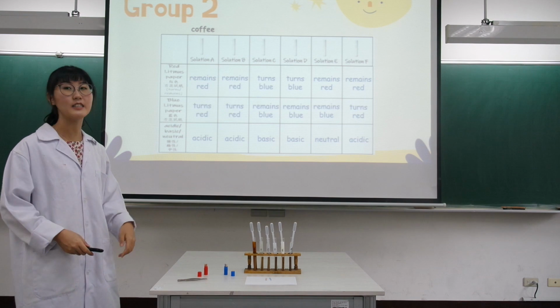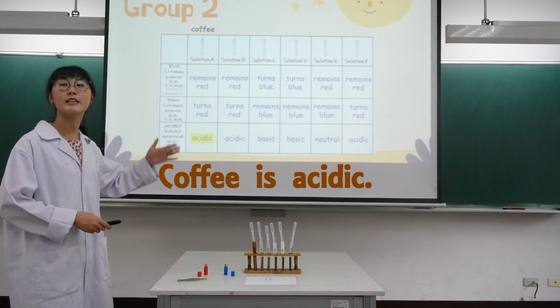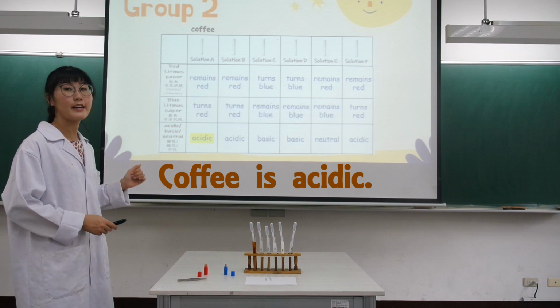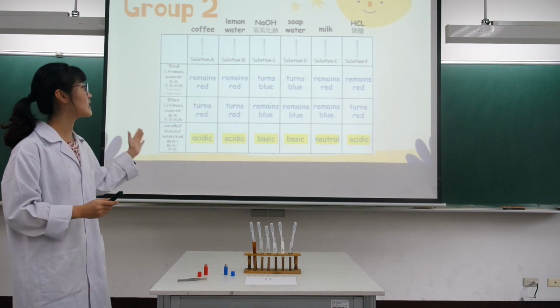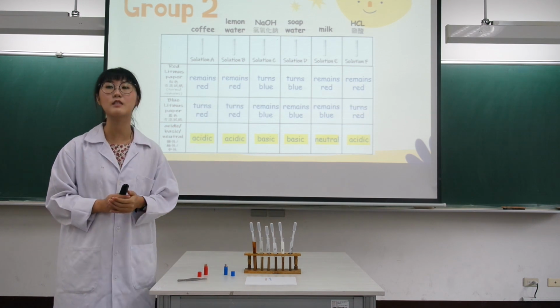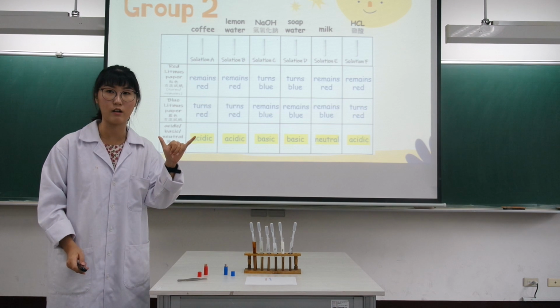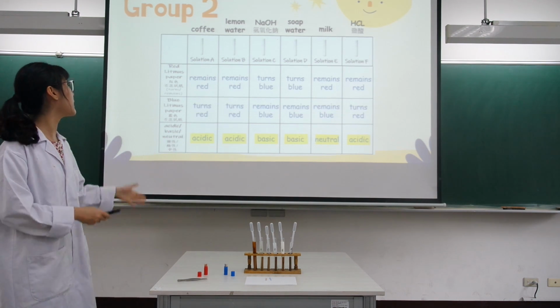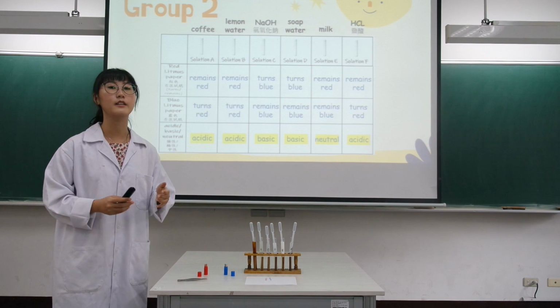Very good. Okay, so coffee is acidic. Can we say it together? Coffee is acidic. Very good. So that's the 6 solutions we're using today. 这是我们今天所实验的6种水溶液哦。所以我们再复习一次。Lemon water is acidic. Okay.